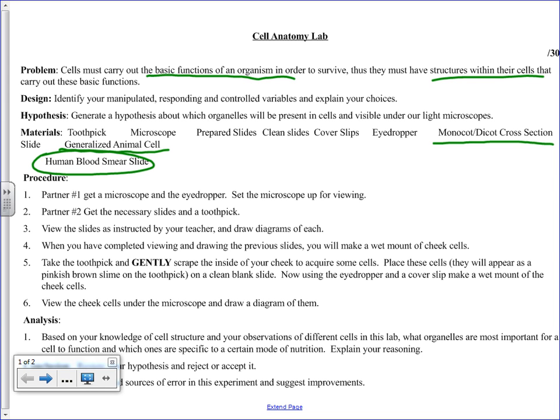But blood cells are different than all the other cells we're going to look at. Red blood cells don't have nuclei. They don't have a nucleus. They also don't divide. Red blood cells are produced by the division of special cells within your bone marrow. So they do come from the division of existing cells, just not from red blood cells.